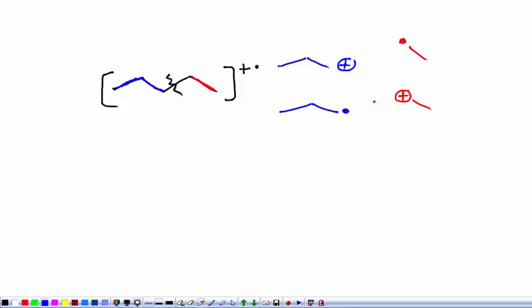Now, from what we talked about last week, radicals, since they don't have a charge, they can't turn the corner in the mass spectrum. They can't be affected by the magnetic field. And so anything that has just a neutral charge is not going to be something that we observe. So we're not going to observe this radical, and the same thing up here, we're not going to observe the ethyl radical. What we will observe are the carbocations. Since they have a charge, when they move, they can be made to turn the corner, and we'll determine their masses.